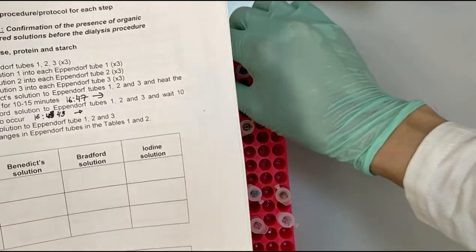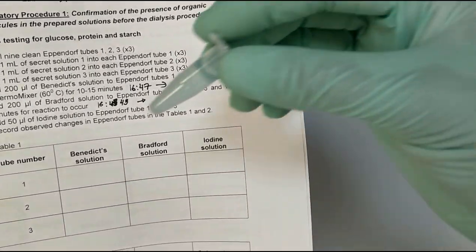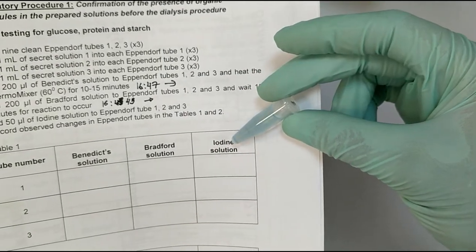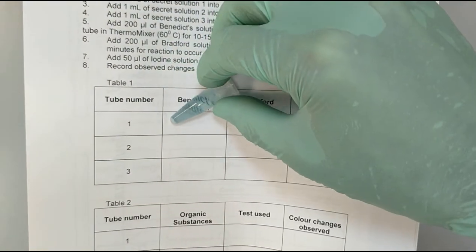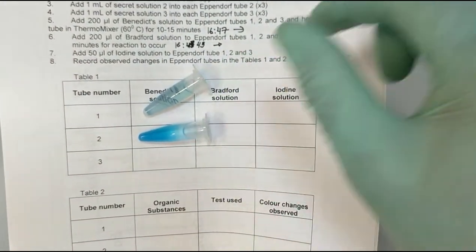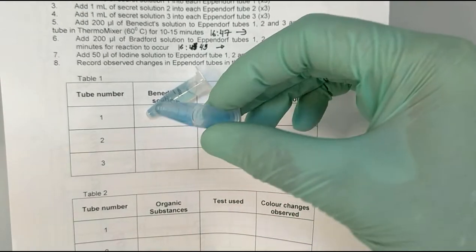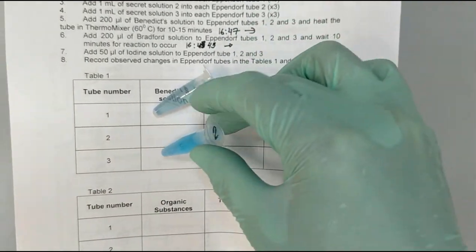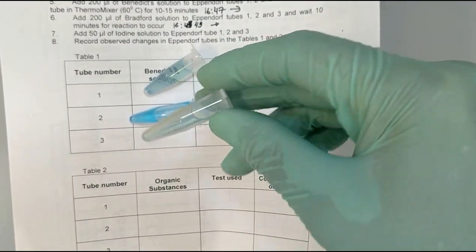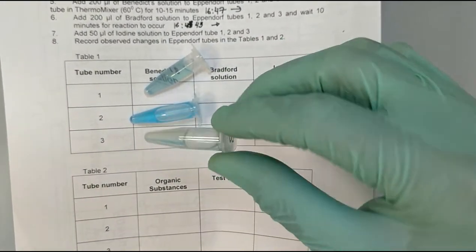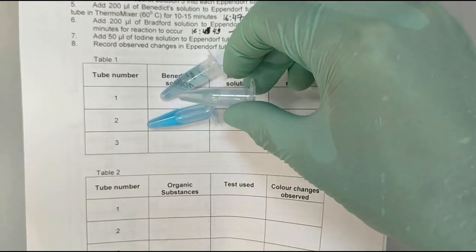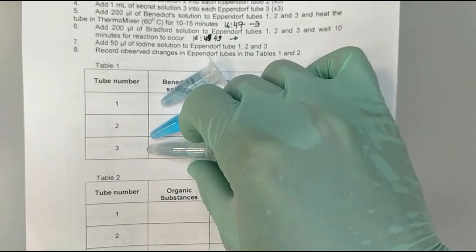Okay, now we can take the Bradford solution and see if there are any changes. So for example, for the first solution, you can see that it is slightly bluish. For the second solution, it is darker blue, and for the last one again, the solution does not have any much difference from the first one.